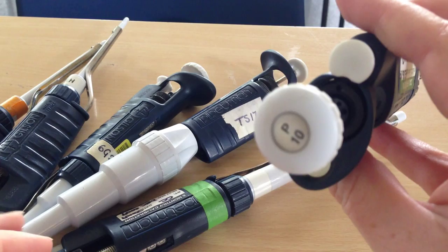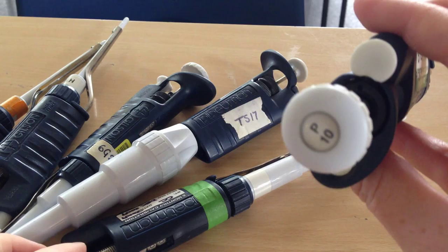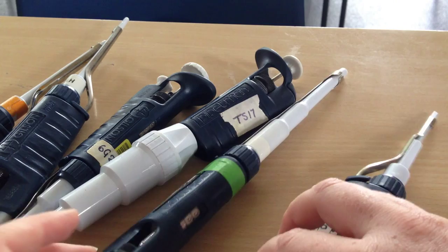So the first thing you need to be aware of is this number at the end here. That will tell you the accuracy or the amount that you can use the pipette for. So this is a P10, so we can use this for 1 microliter up to 10 microliters.